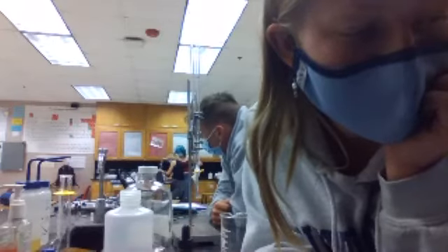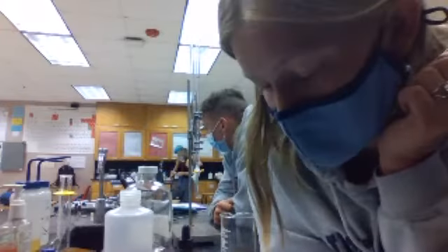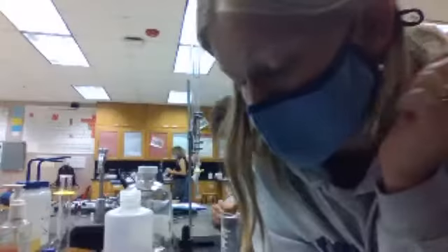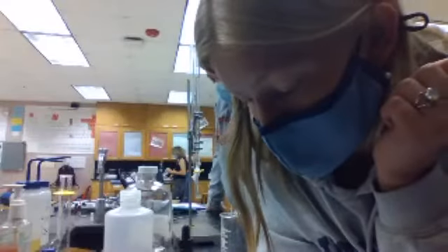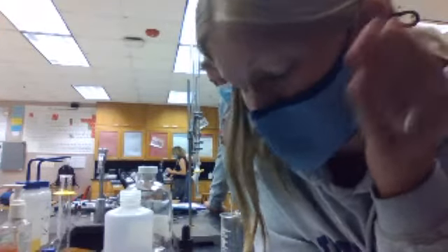I think you would, wait. No, you don't do 28.4, because that's what we're trying to find. So you use the final volume of the acid. We use the 19.99 and the 30. You use just the 30, don't use the 19.9, because we're trying to find the final volume of the base.